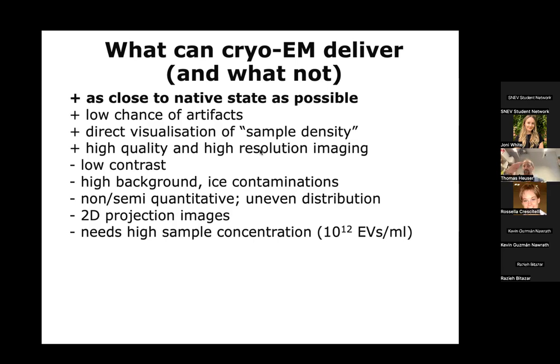As I showed you before, we're also missing some 3D information. So if you want to decide whether this is really a vesicle in another vesicle or just on top of it, this is still limited. Sorry, that was a little bit confusing.